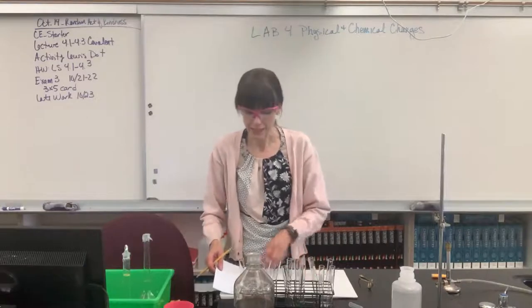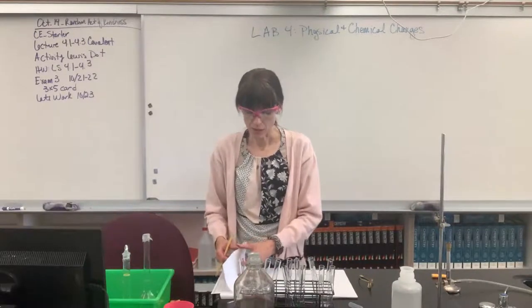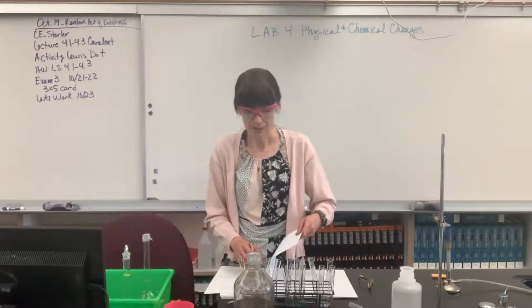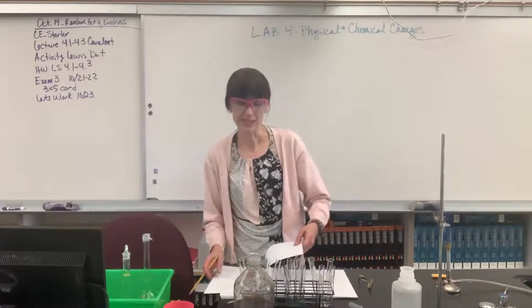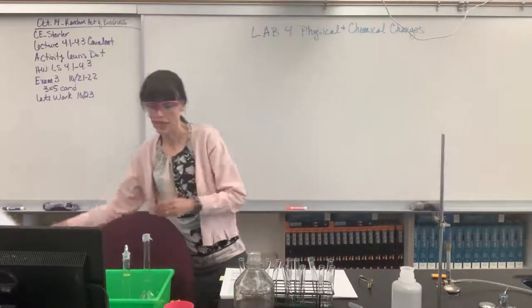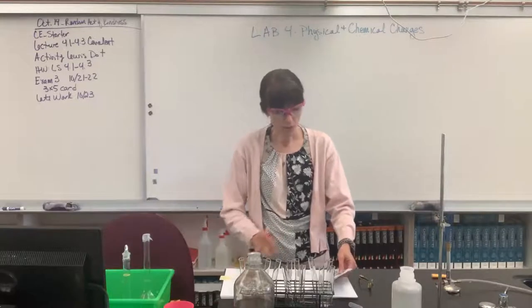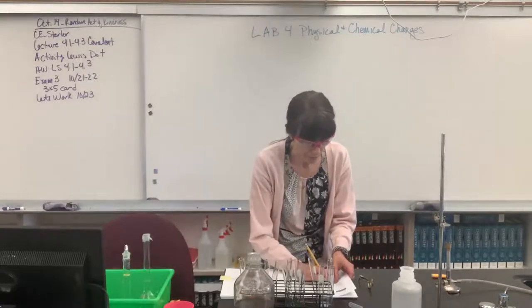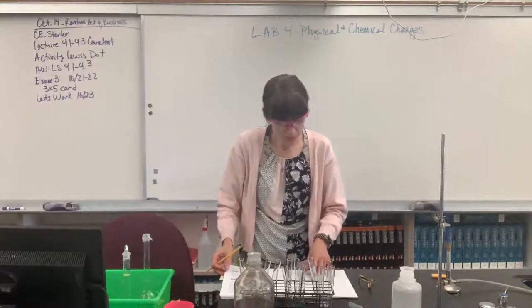Now it calls for a potassium ferrocyanide. You guys, because of that ending cyanide, I don't have that. So I'm just going to give you the answer to that. If we were to add that, and I'm sorry we don't because it would be a pretty reaction, if we were to have the potassium ferrocyanide, it would go a dark blue. So let's record that right now. And I apologize that I don't have that. It's a safety thing. So I'm on page 54 where it says result of adding K4Fe(CN)6, you're going to put dark blue. We didn't get to see it, but it was dark blue.